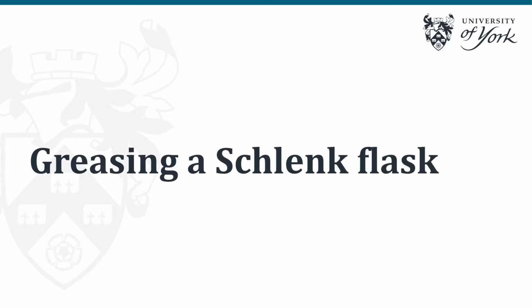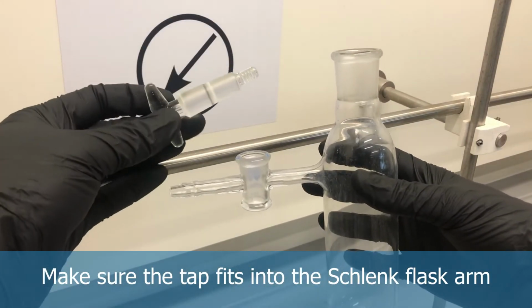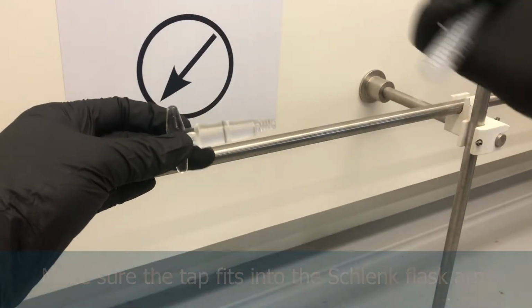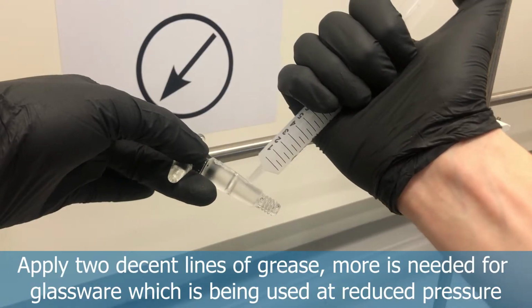And also grease is one of the main contaminants in any kind of Schlenk related work, so it's good to know how to properly clean glassware. So first things first, you need to make sure that the tap fits into the Schlenk arm. Not all of them are the same size. And then we're going to apply 2 decent lines of grease on the side.